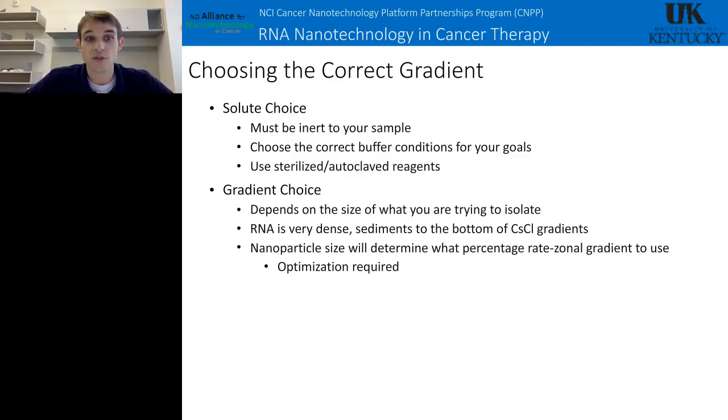Also, another important part is that your solute needs to be easily removed from your sample. You don't want to use a solute that you don't think you're going to be able to separate from your sample, because then your sample will have that for its entirety, and it might be useless depending on what you're trying to do with your sample.